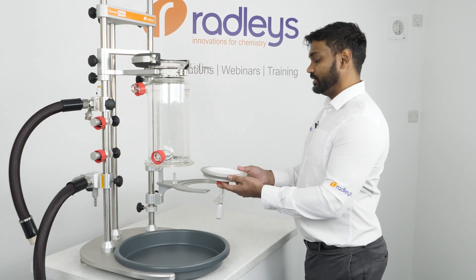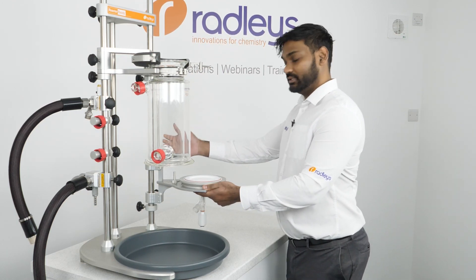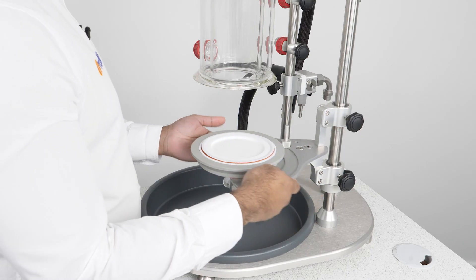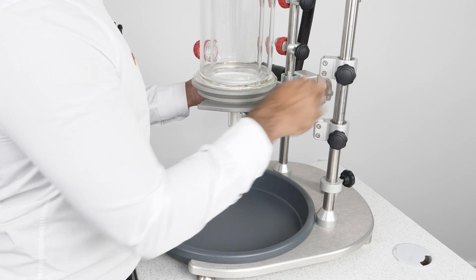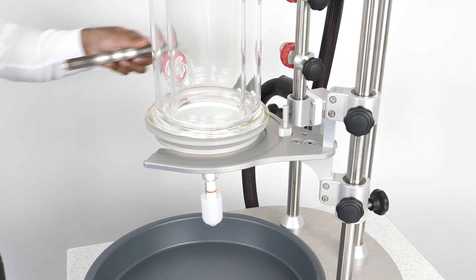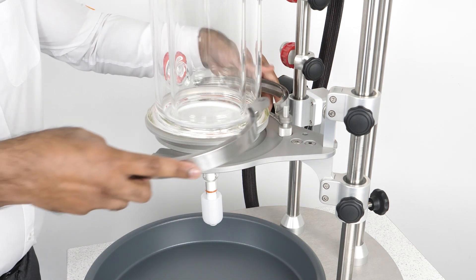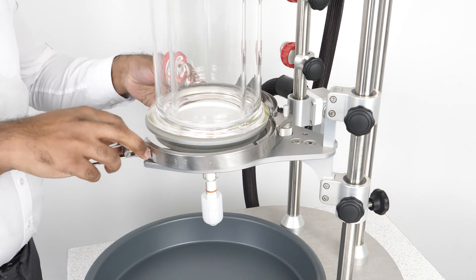We place our filter base onto the base support here, which has a fixed support rod, and we slide it up so that the base is in the correct alignment with the vessel. We then place our removable clamp onto this pin and secure our filter base onto the vessel.